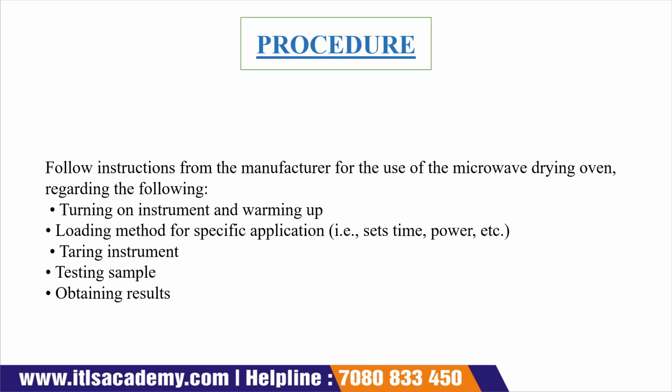Here the procedure is very easy. We simply have to follow the instructions already given in the microwave drying oven, which are provided by the manufacturer. We have to read these instructions and follow them. This way we can easily handle the microwave oven.